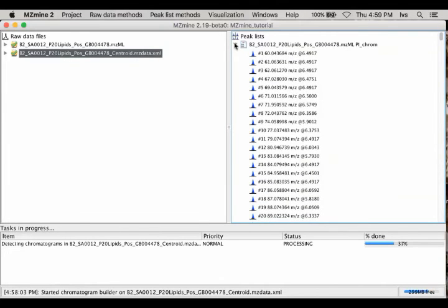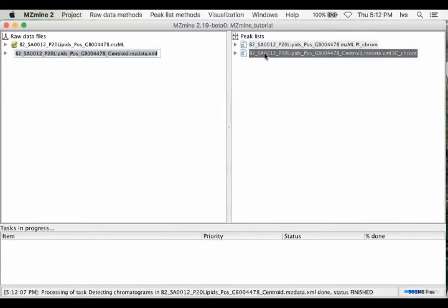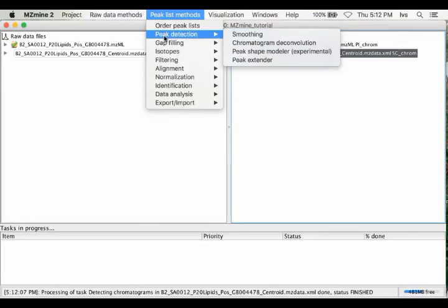Now that the chromatographic peak lists are complete for both datasets, we can proceed. As you saw in the previous chromatogram, there can be a long tail. There can also be multiple chromatographic peaks that appear at different retention times in the same chromatogram. For example, cis and trans isomers of the same olefinic species that elute at different times. These must be deconvolved to create an accurate chromatographic peak list.